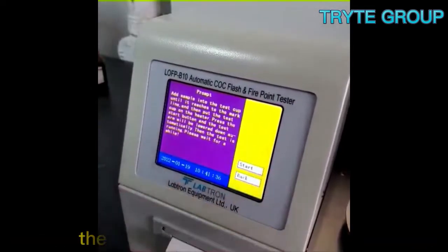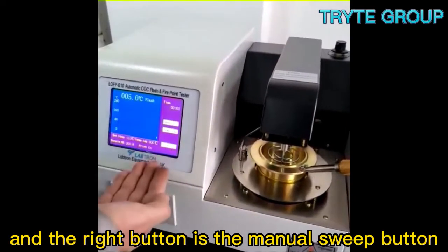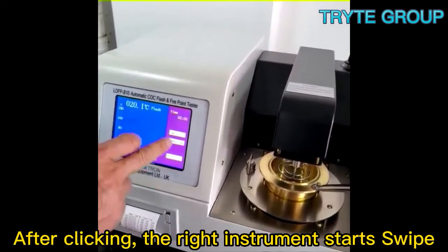After the start, the right instrument starts to act. The right button is the manual sweep button. After clicking, the right instrument starts to swipe.